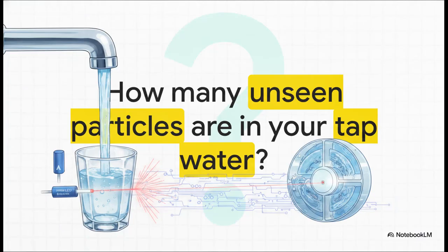The next time you turn on the faucet and fill a clear glass from the tap, take a second to appreciate it. Think about the vast, largely invisible optical engineering, the infrared LEDs, the perfectly angled 90-degree detectors, the baffled debubblers, and the meticulous lab experiments like Dr. Chem's, working tirelessly behind the scenes so every single drop you consume is pure, clear, and perfectly safe. So how many unseen particles did a beam of light have to find to guarantee your water is safe today?